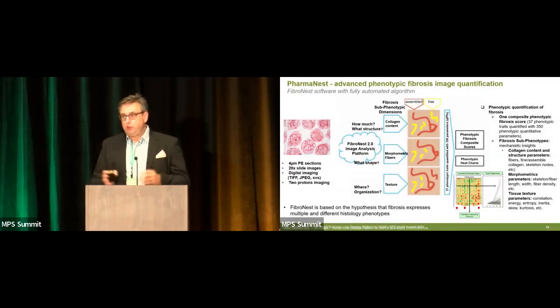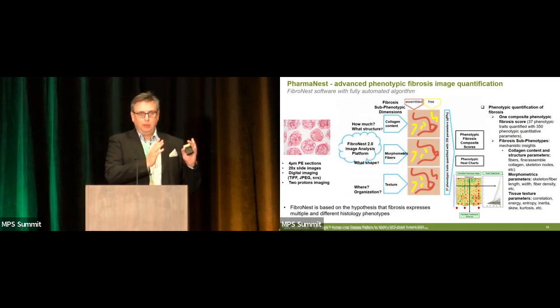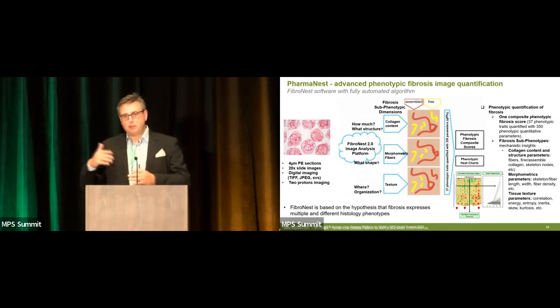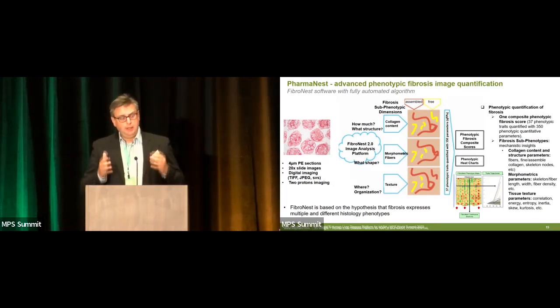Now, what are we doing about fibrosis? We are able to look at procollagen in the supernatant. It's a precursor of the collagen deposition. But of course, we really want to have a good understanding on a morphological level of what happens in these microtissues, so that we can assess the impact of a drug on fibril deposition, and also the formation of fibrotic fiber networks in these systems.